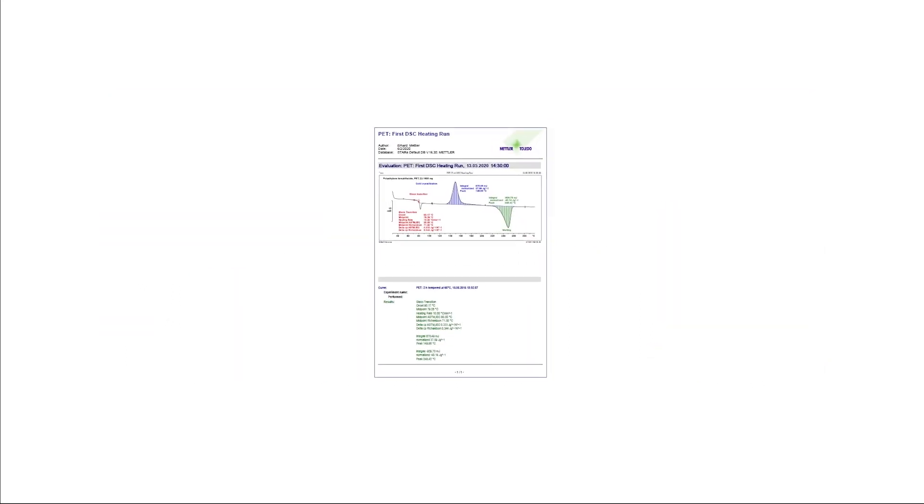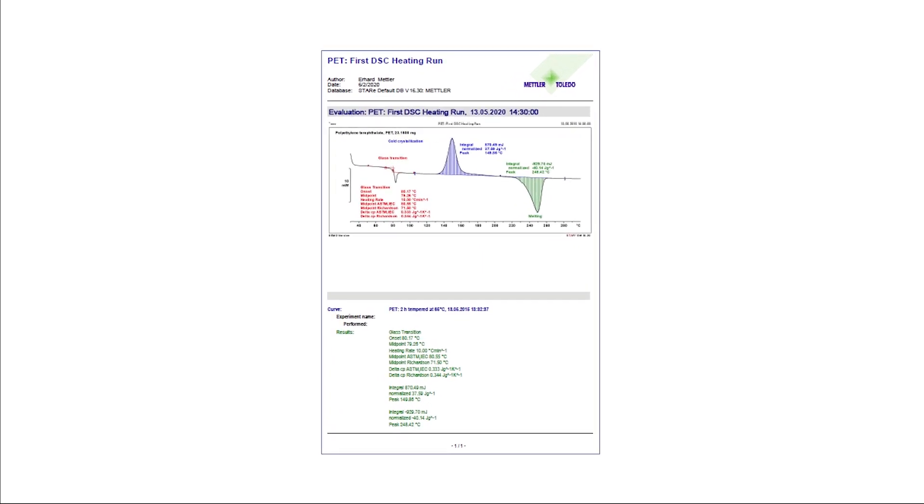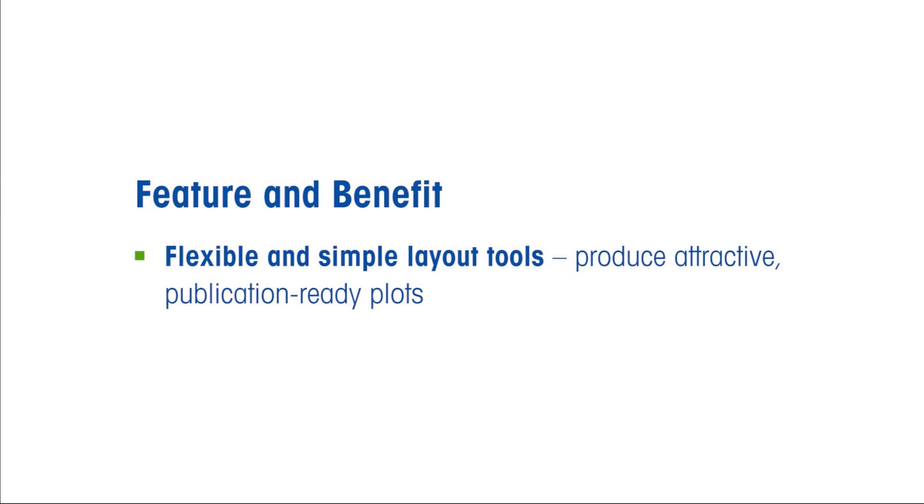The measured curves and numerical evaluations can also be incorporated into an attractive and professional report template. STAR-E software's flexible and easy-to-use layout tools allow you to produce attractive, publication-ready plots.